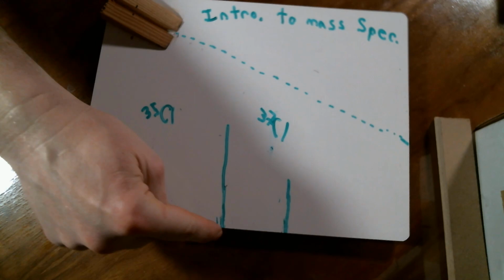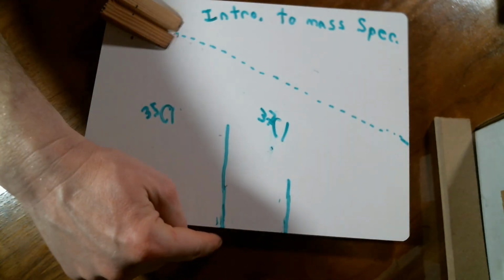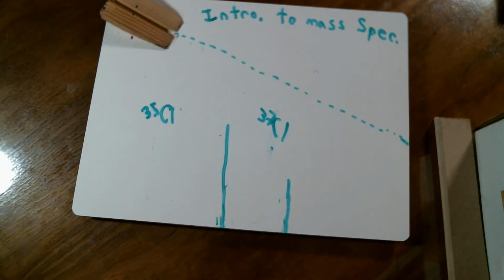And then last but not least is the detection. When it falls off the edge, we get a line or a counter that is making note of how many of each of these things are falling off of the side.